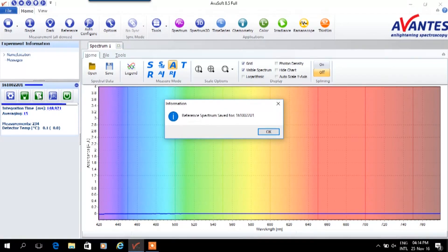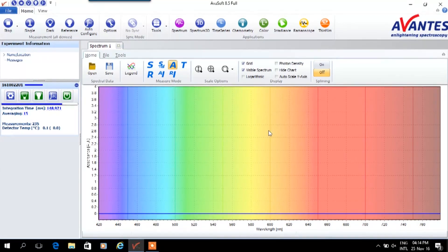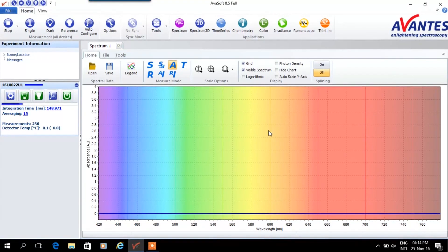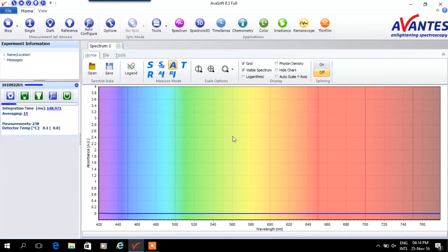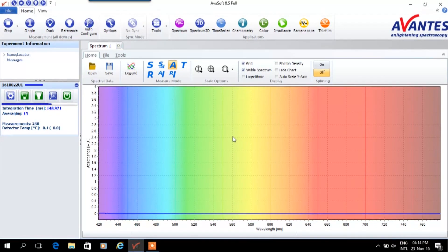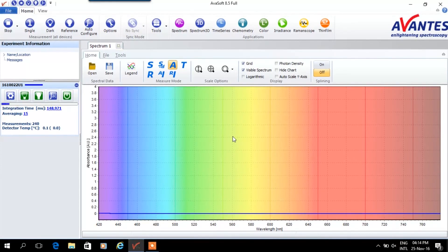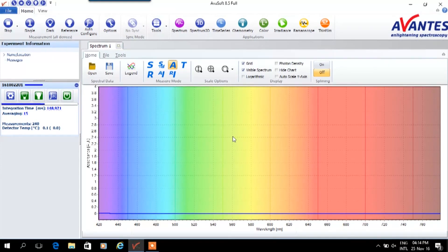The white and dark measurements are used to determine the measurement range of the absorbance measurement. Measurements will be scaled between these two references. We are now ready to measure absorbance on the samples.